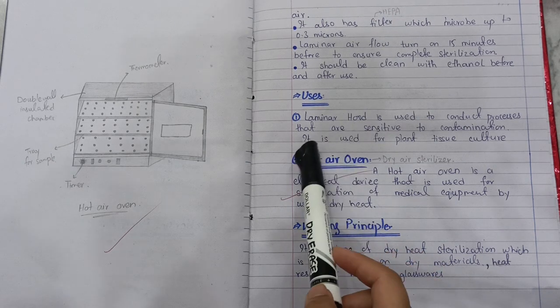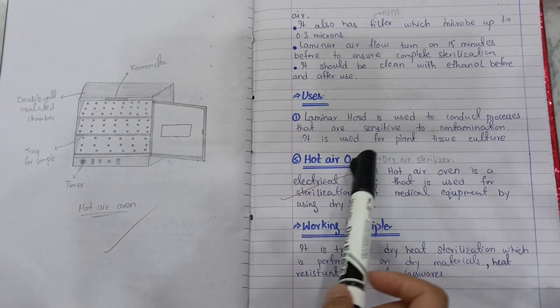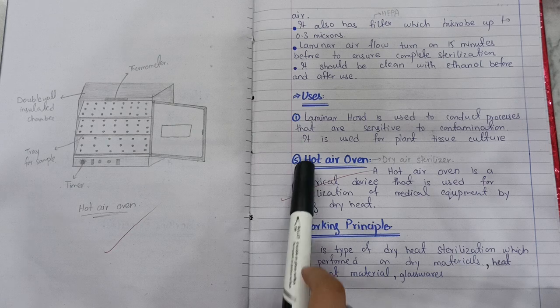All the things are repeated down, and it is also used for plant tissue culturing. Next instrument is the hot air oven.